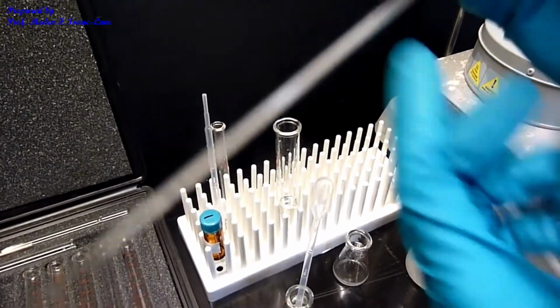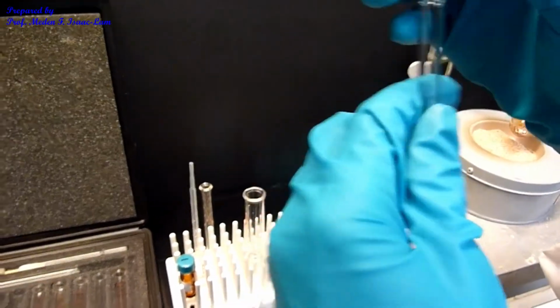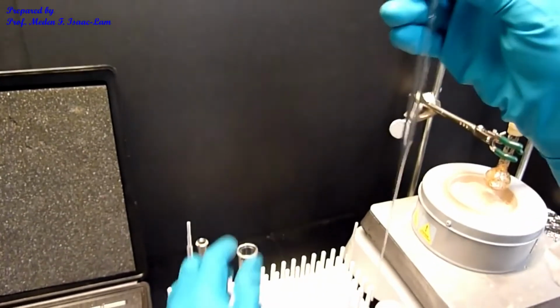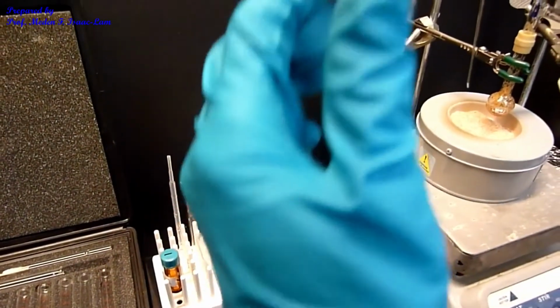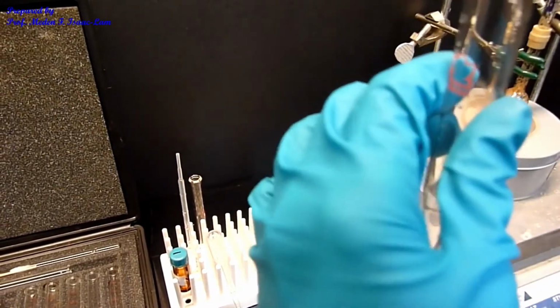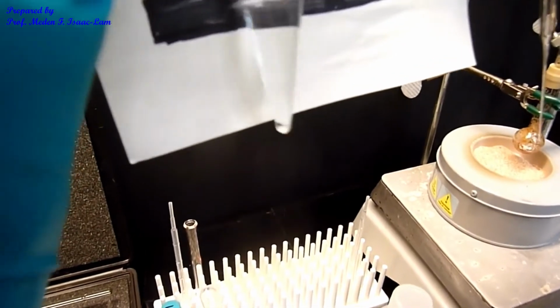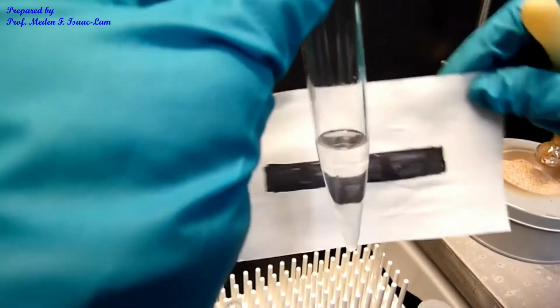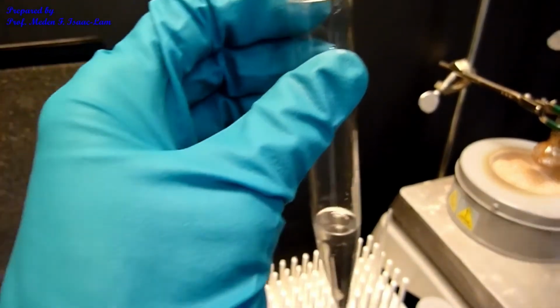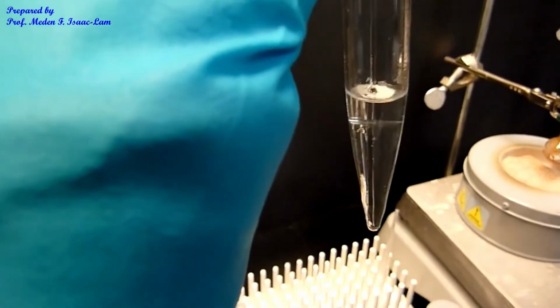So I took a different pipette. This is a disposable glass Pasteur pipette, and then I put a bulb. And this is longer, so I want it longer because I want to take out the lower layer. As you can see, there's a layer that I want to get rid of. That was the wash. So I want to use this long pipette, and I'm getting rid of the bottom. So I put it all the way to the bottom.